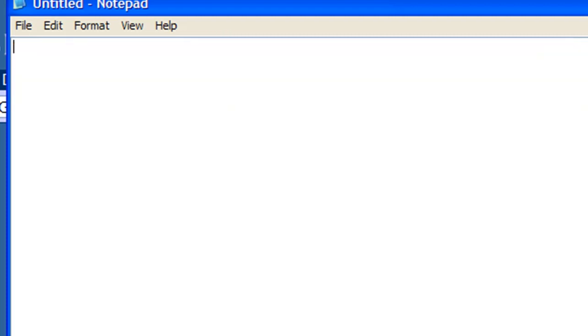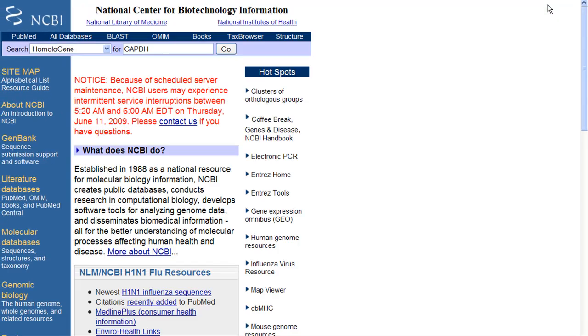I'm going to go ahead and clear this out, and we're going to go to the National Center for Biotechnology Information. Here's the link. It's publicly available.